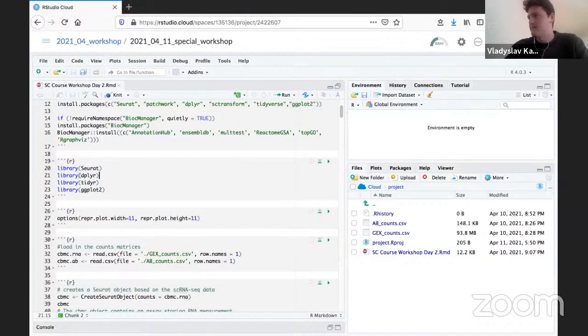Write me in the chat in Zoom so I can see you and then we can resolve your problem. I see that nobody wrote, so I assume that we can continue. If you can see the file, it may be helpful to refresh the folder here. You can go back and then go once more into your folder and you will see the files here.